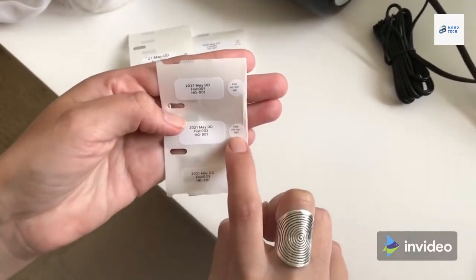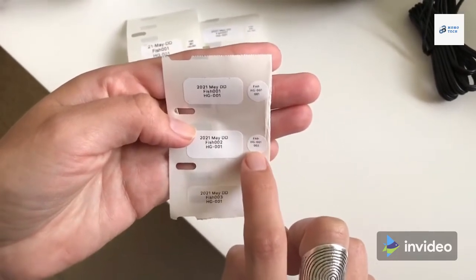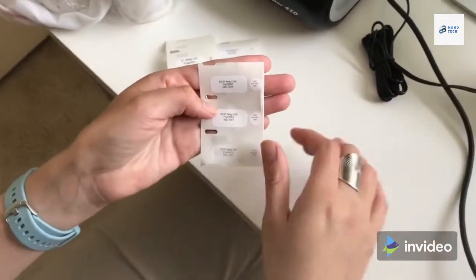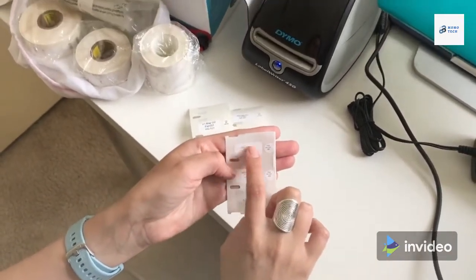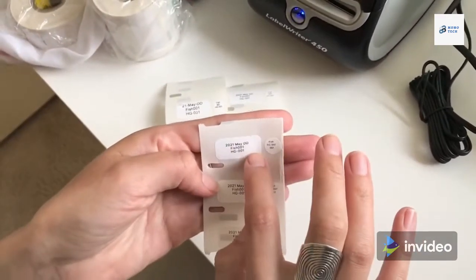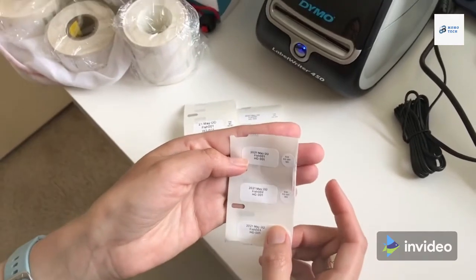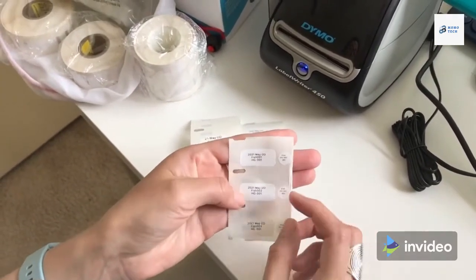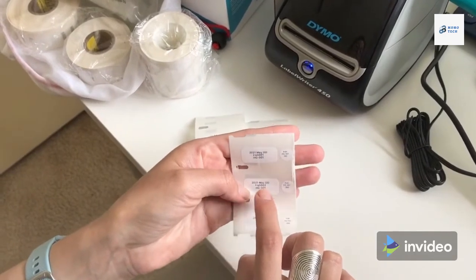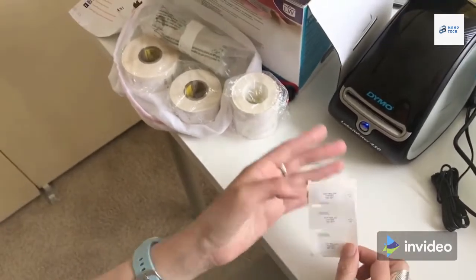You always have to consider that for the EpiTubes, the label is really tiny, but it still helps you get more information about what you are looking for in the box. This one fits way more information than the one that I added here, so feel free to add another row of information or even a longer one here. I tried to add QR codes, but they're too tiny to be scanned, so I will not recommend doing that for these tiny tubes, but you can absolutely do that for the boxes or something bigger.